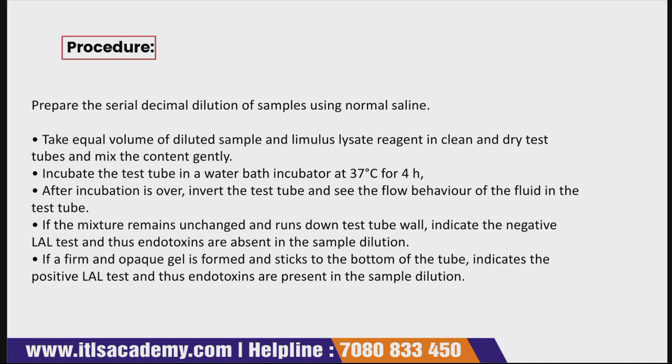in the test tube. Now if the mixture remains unchanged, meaning there is no change in the mixture, and it runs down the test tube wall, this indicates a negative LAL test, and thus endotoxins are absent in the sample dilution.